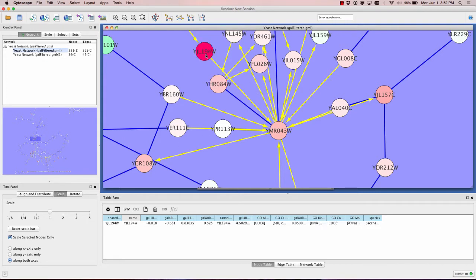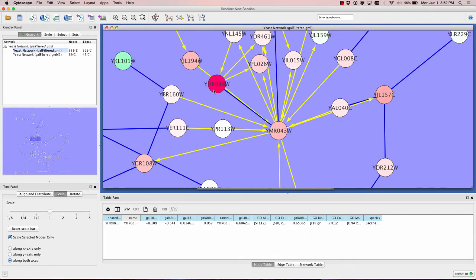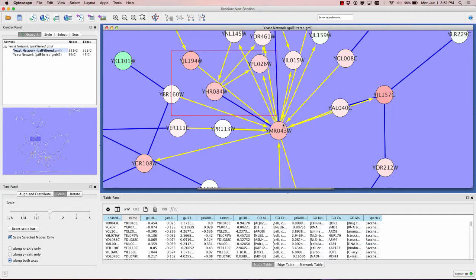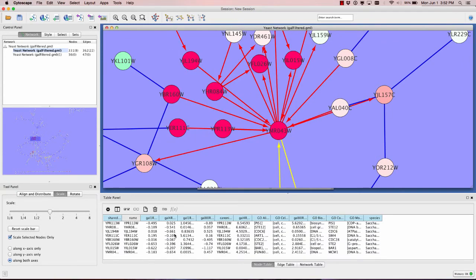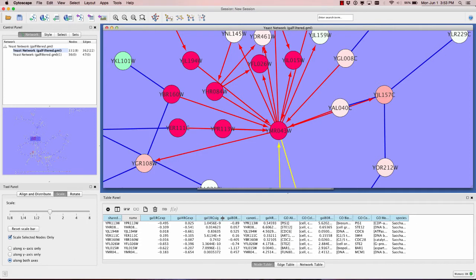When I click on a node, I can see at the bottom in the node table the node I've clicked and whatever additional data is loaded up. The data loaded up in the sample file is gene expression data, and it's visualized as colors on the node - red is overexpressed and green is underexpressed. There are a few different types of expression data loaded here - these are log fold changes in the expression data columns.